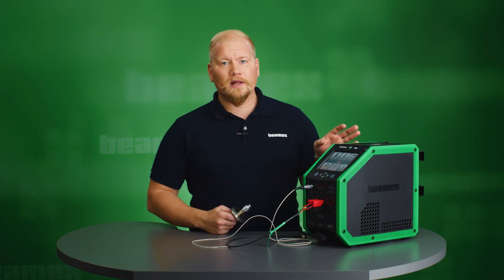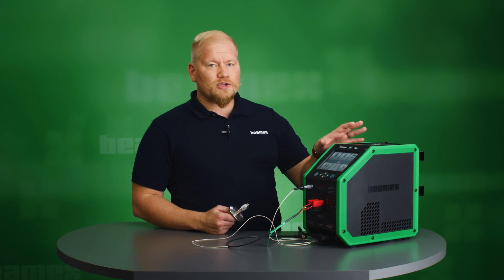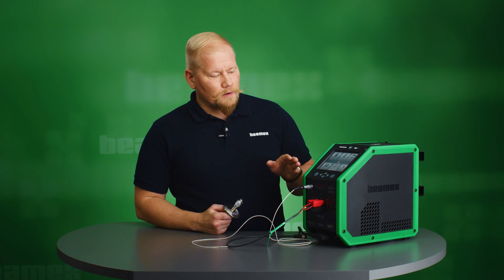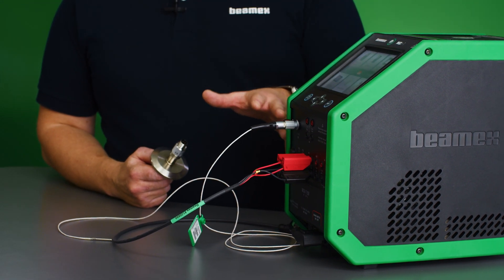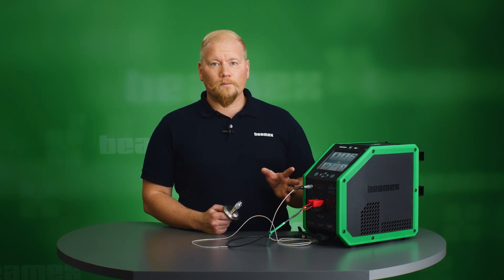This is a dry block that has a range of minus 30 to 150 degrees Celsius, and it has basically two functionalities: the dry block side and the multi-function communicator and calibrator. We have three RTD channels on board, meaning you can simultaneously measure three RTDs. There are also a lot of other features and functionalities — to find out more, please visit our YouTube channel and watch the videos.